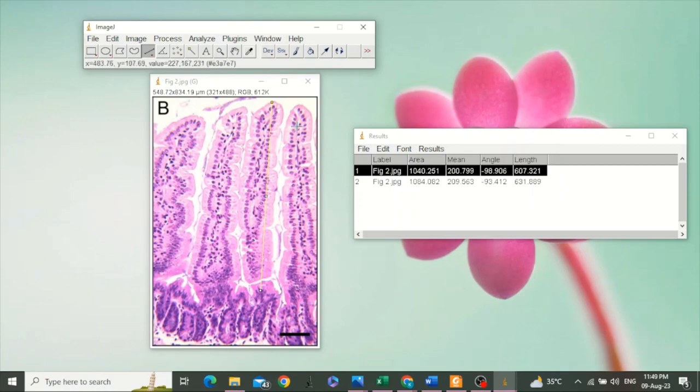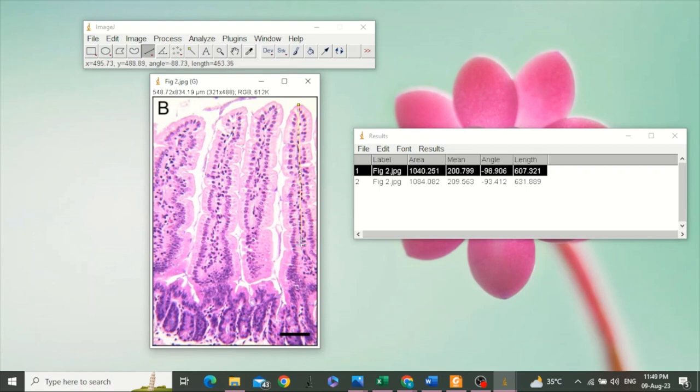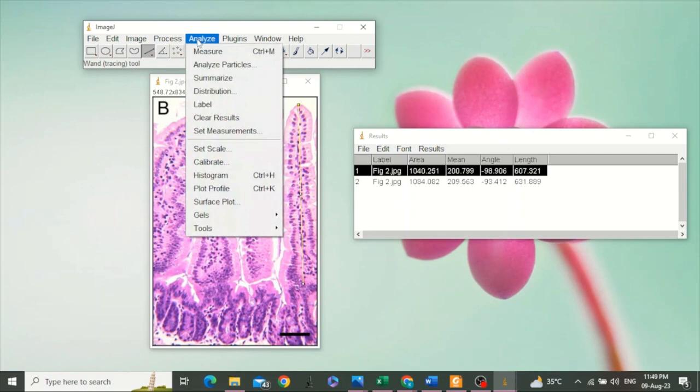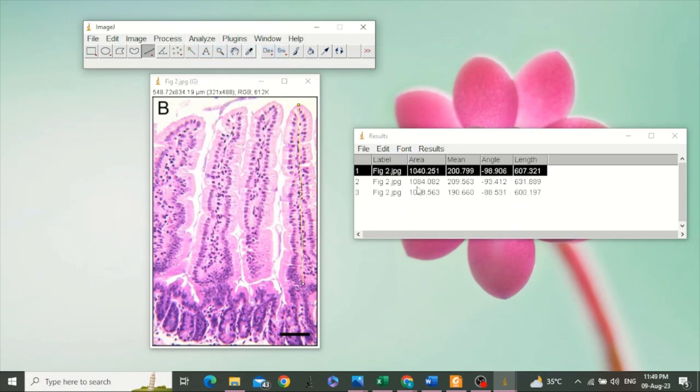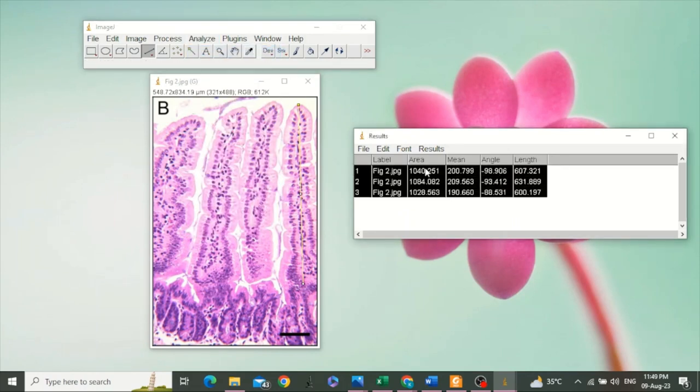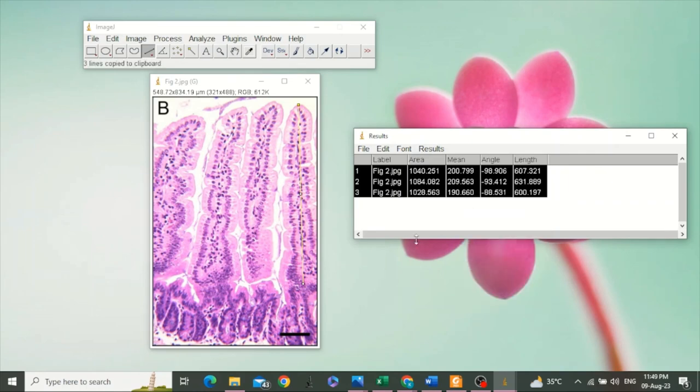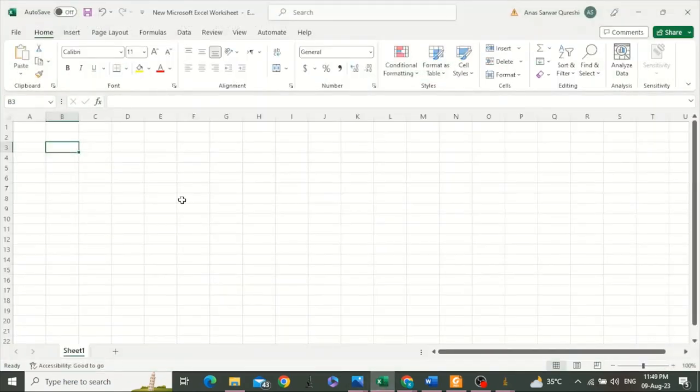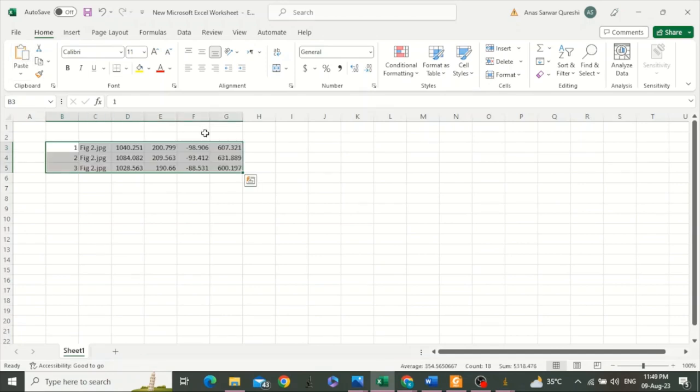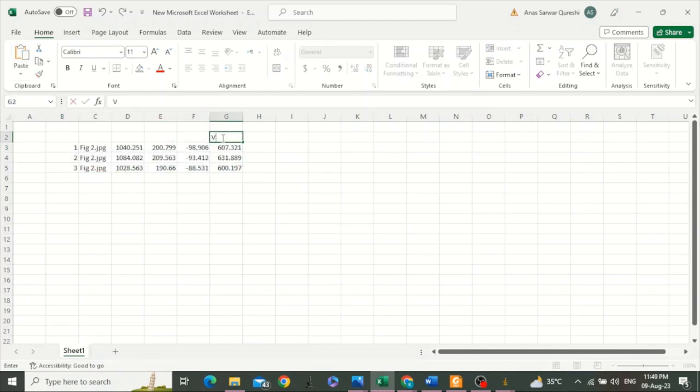Take the third measurement and go to Analyze, select Measure. We have taken three measurements. We can select all these and copy these results into an Excel file. And this is villus height.